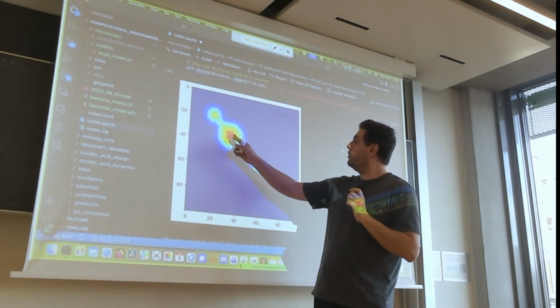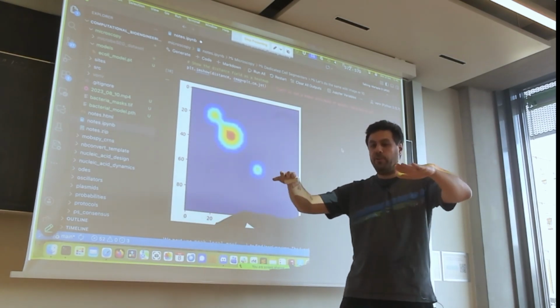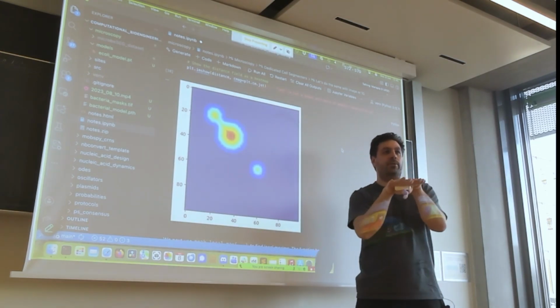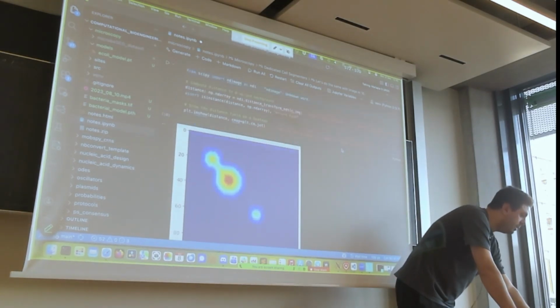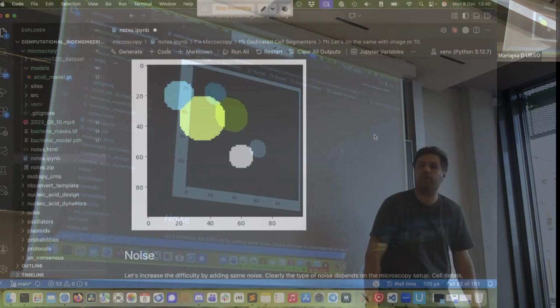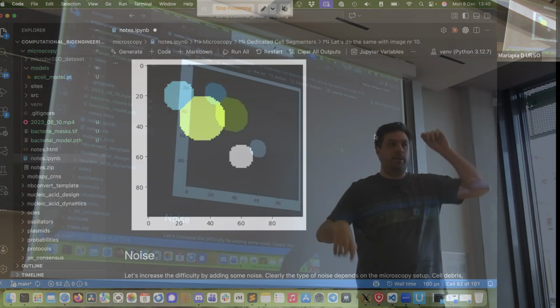But here, what will happen is, at some point, these two water ponds will start to connect. And at this time, you stop it. And you draw this connection line. And if you do this, you get this, right? Like we have filled up this pond, we have filled up this pond and this pond, and they start to touch here at this intersection. And this is the principle.